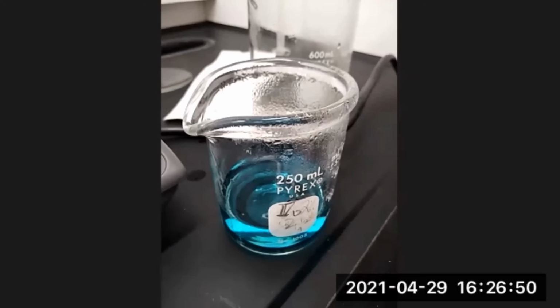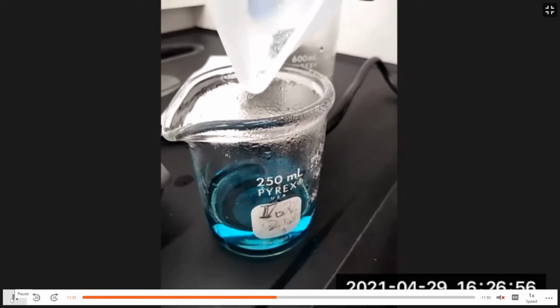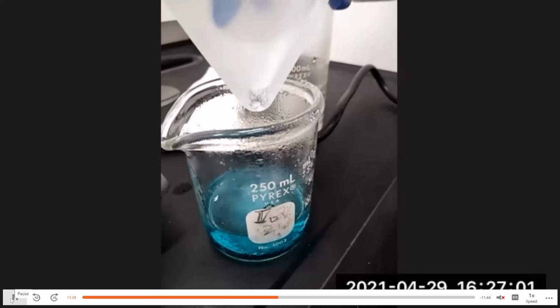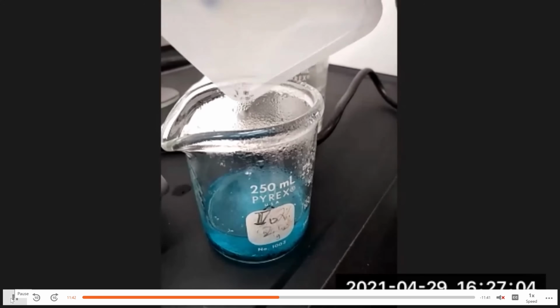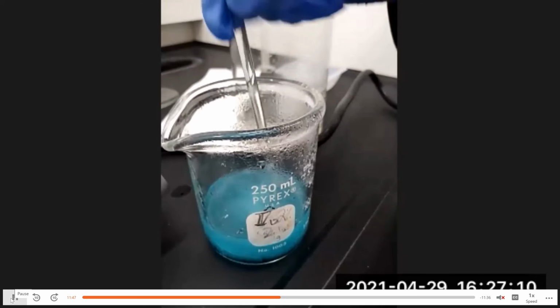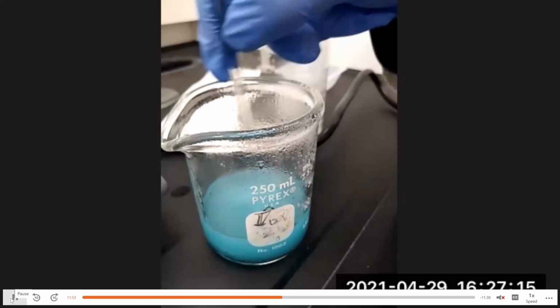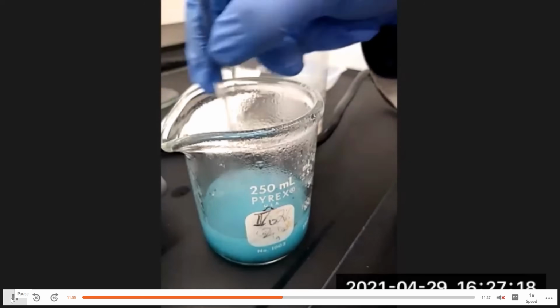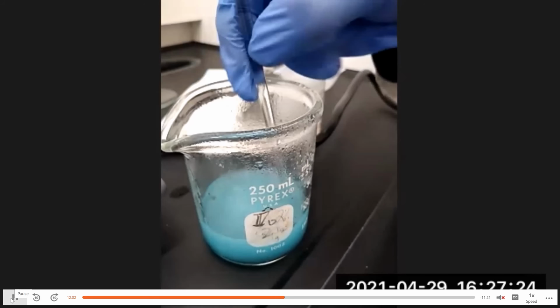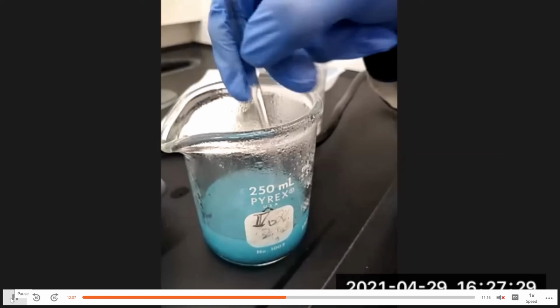Next, we're going to add the zinc metal into the solution so that we can do a single replacement reaction and exchange the copper ions for zinc ions, and the copper will precipitate out of solution. The reason that copper will be replaced by zinc is because zinc is more active than copper. So zinc will replace copper in solution. And what you should see is over time, the solution should go from a blue color to a colorless solution.